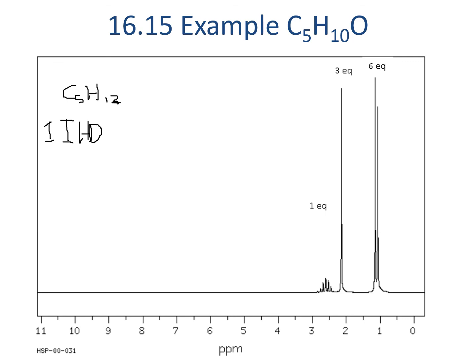We also know that we have 6 equivalents of one type of proton, 3 equivalents of another, and 1 equivalent of a last. And we also know that the 3 equivalents has no neighbors. That's most common when we have a CH3 that's attached to something that can't be attached to hydrogens, like a methyl that's off of an aromatic or a methyl that's off of, say, an oxygen. So that'd be one way that we could have that happen. And then we'd have the other carbons on the other side. So maybe something like this.